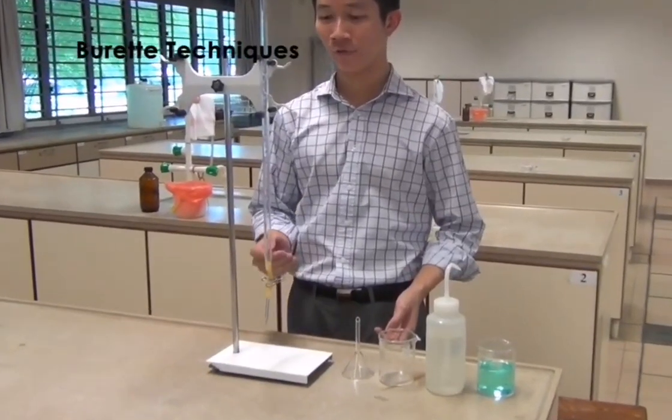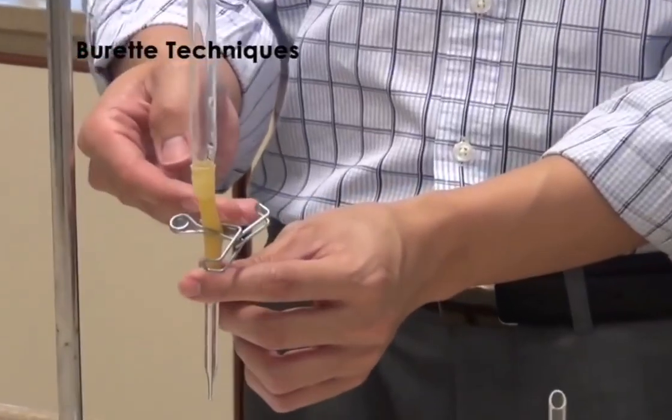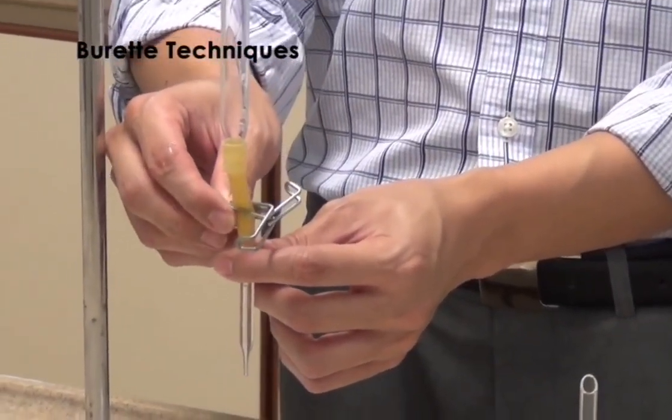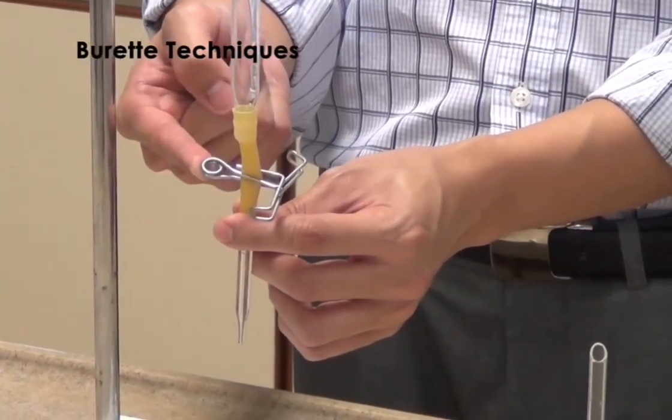First, you will have to fit the burette clip onto the burette. Make sure that the parts of the clip clipping the burette is as close as possible to the ring of the clip.